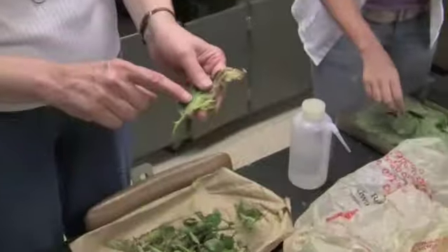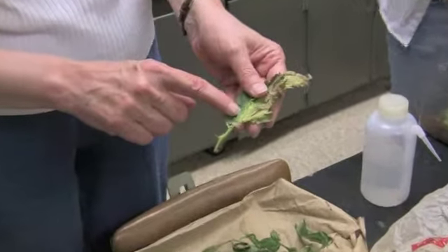Bob, you've brought in some tomato samples here into the C. Wayne Ellett Plant and Pest Diagnostic Clinic, and I'm going to take a look at them here. But first, let's take a look at the overall symptoms. You've told me that they're concerned about this spotting that they're seeing on the tomato leaves.